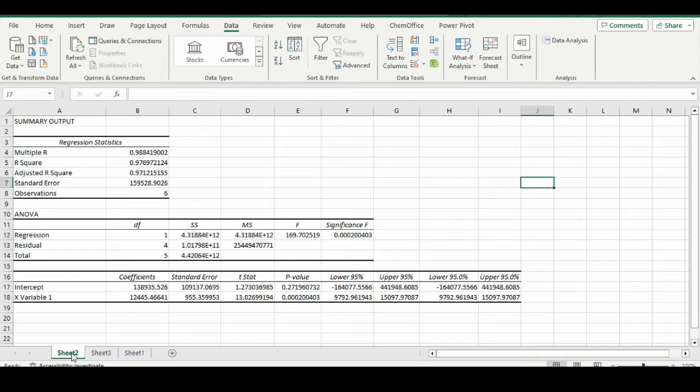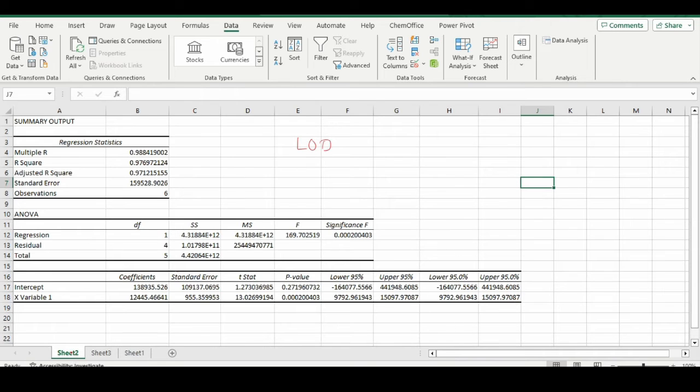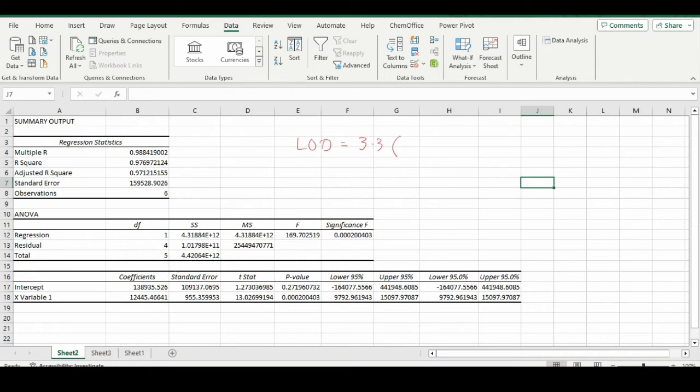The expanded form of this sheet is here. Our points of concern are two values. When we are finding the LOD, the formula for LOD is 3.3 times sigma over s.